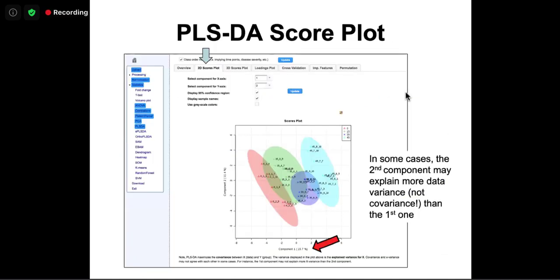So Jeff, it's Dave. Mathematically, it is correct that they can do the t-test if they keep things in the principal components, and they can do the assessment of separation. Yeah, that's true. It's mathematically correct. It's just the statistical testing that I don't understand what it answers, except the plot seems to show significant separation. It's beyond that. I just can't relate it back to the overall big picture. At least I can say it's not common, but mathematically, clearly, we can test it.